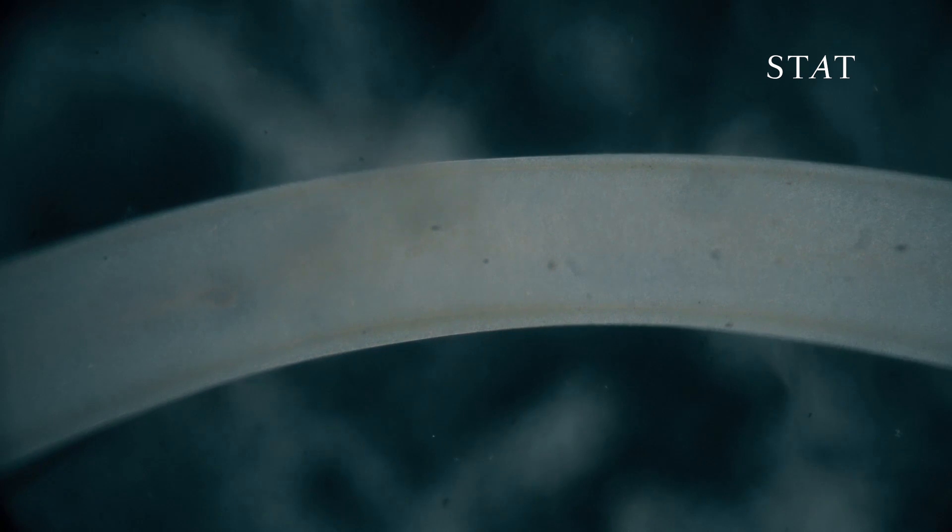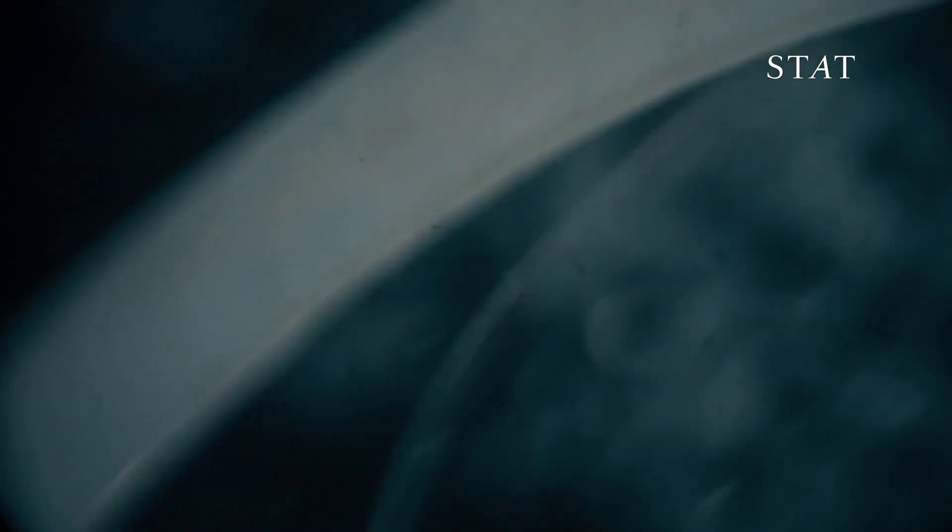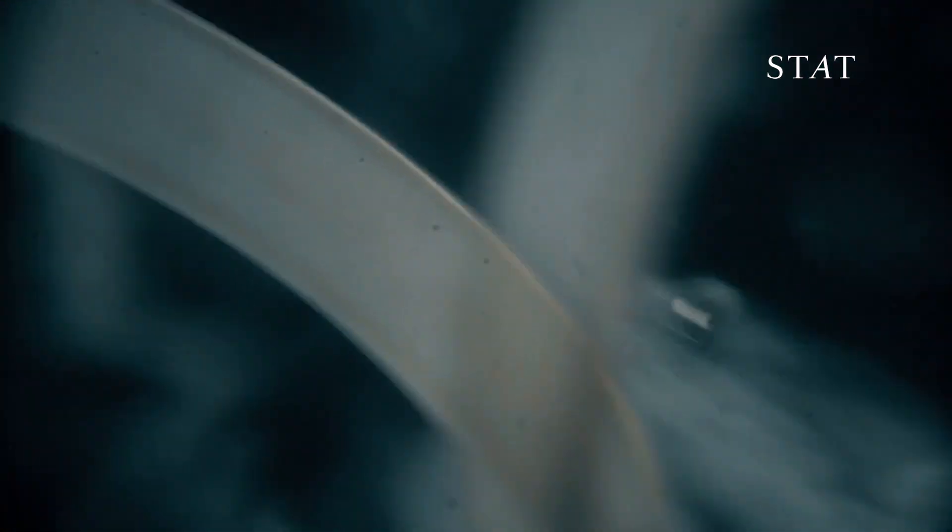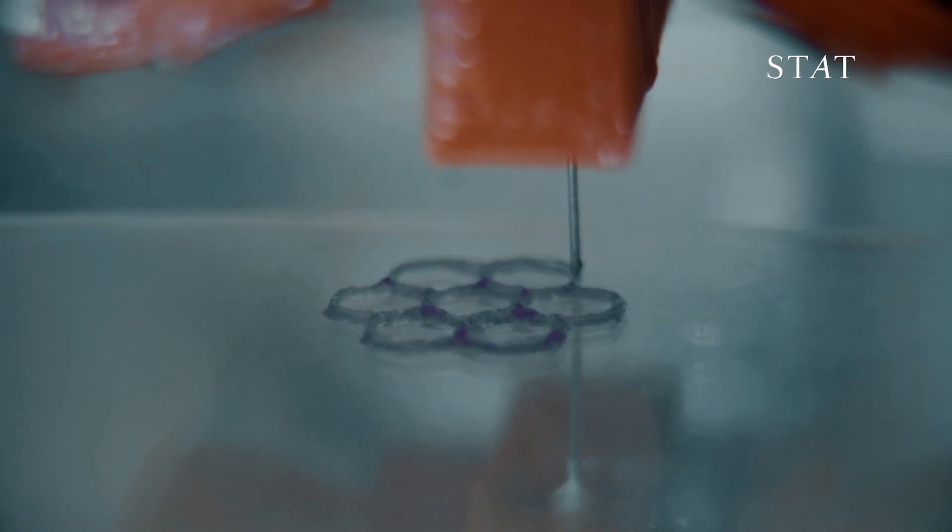These bioprinted blood vessels can also be used to test the safety and efficacy of drugs. We can now use these three-dimensional miniaturized tissue models for screening drug molecules at higher accuracy and better predicting human responses.